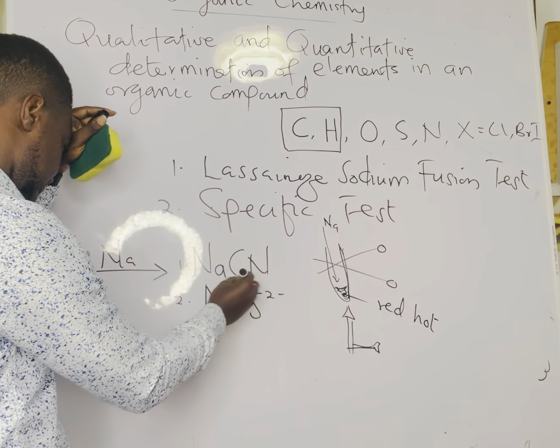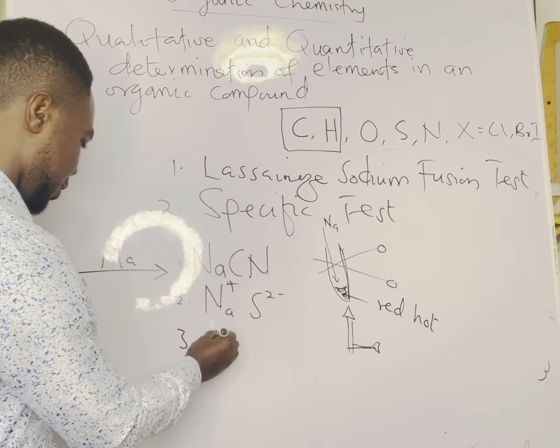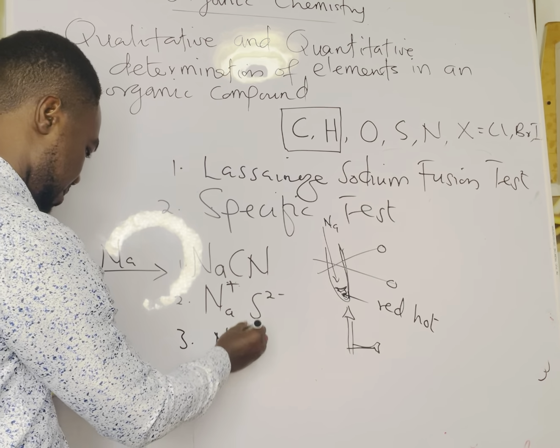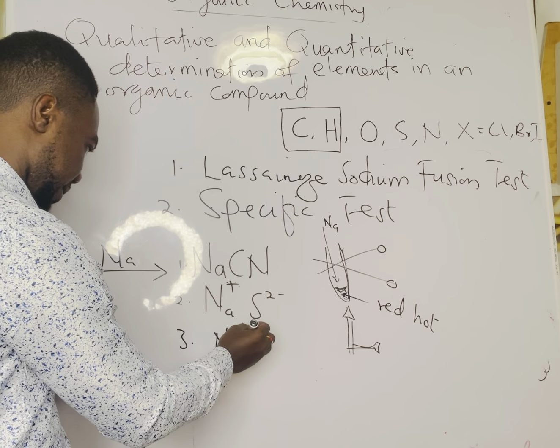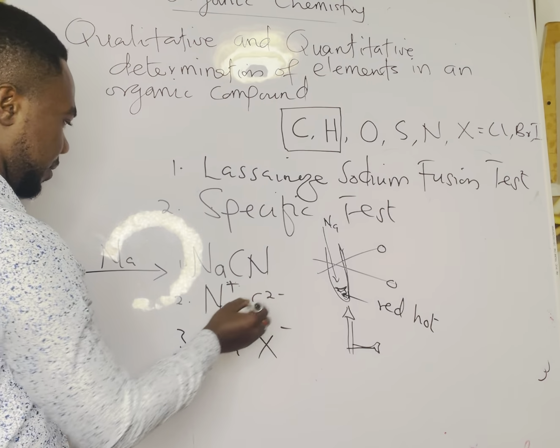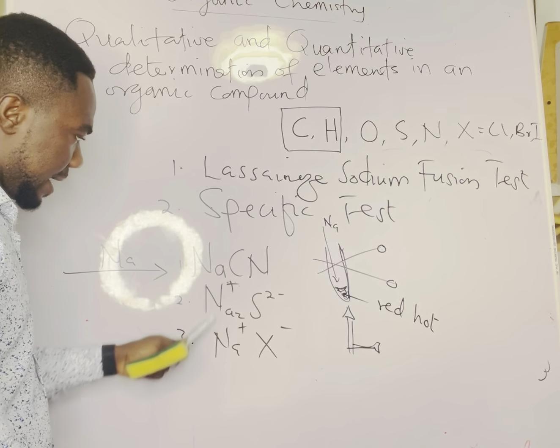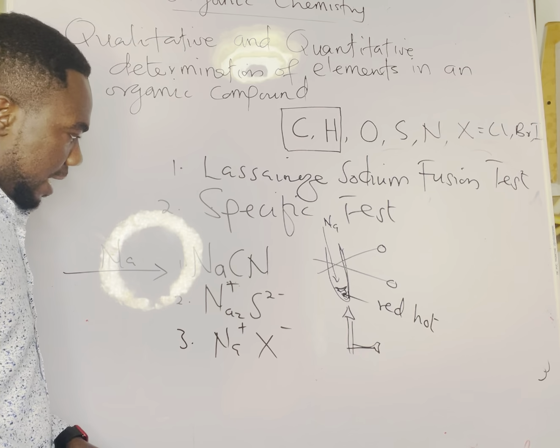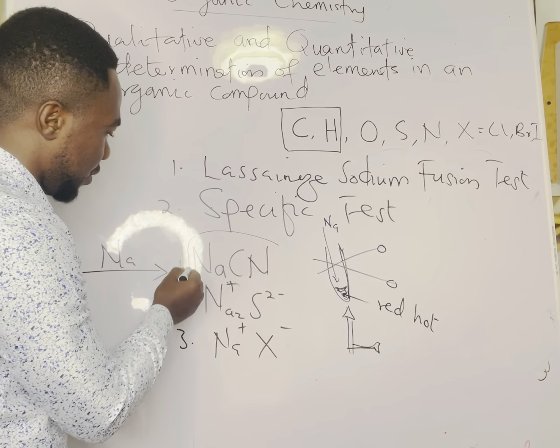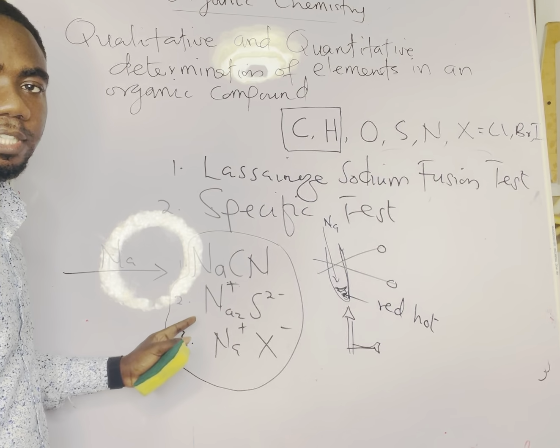Then we also have sodium bonding with S groups. Okay, like that. So these are the products after the filtration, the Lassaigne Sodium Fusion Test.